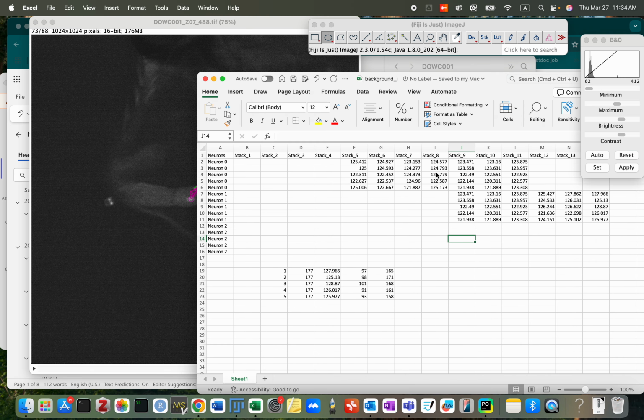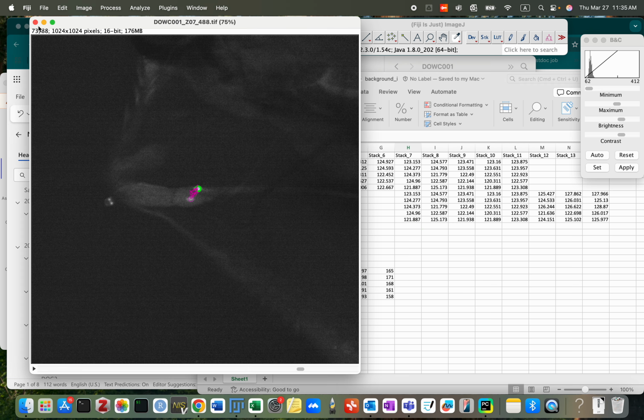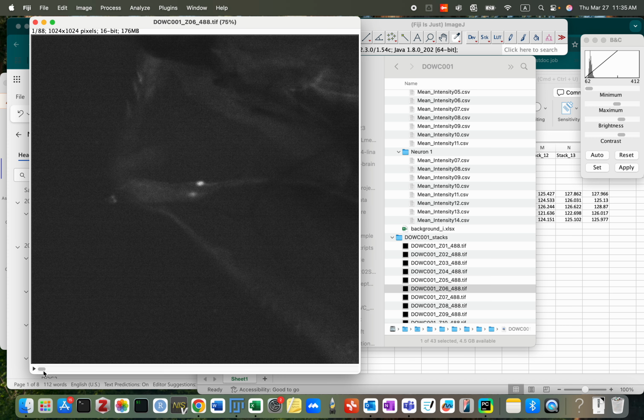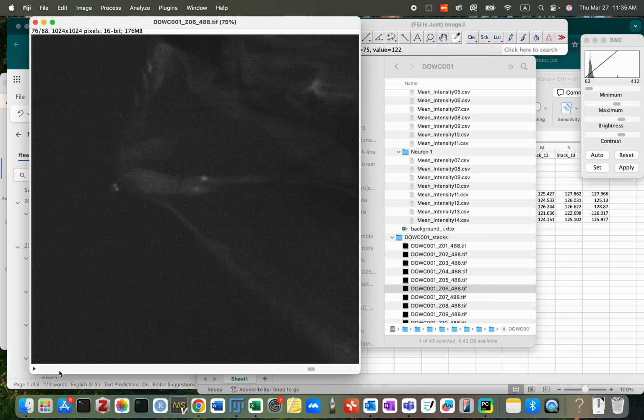Check the background. Number 7 we'll still work with. Let's see number 6. Okay, after playing across all the time points, I believe I have stronger stacks. So I will stop at this point.